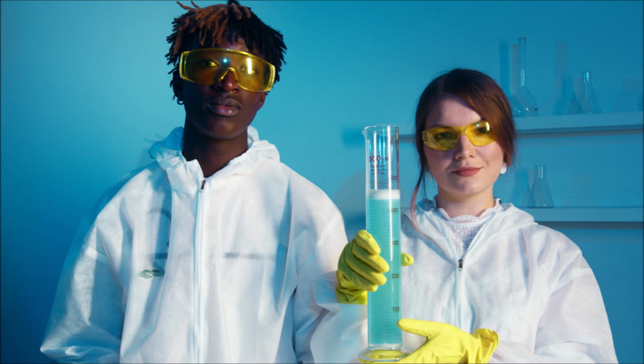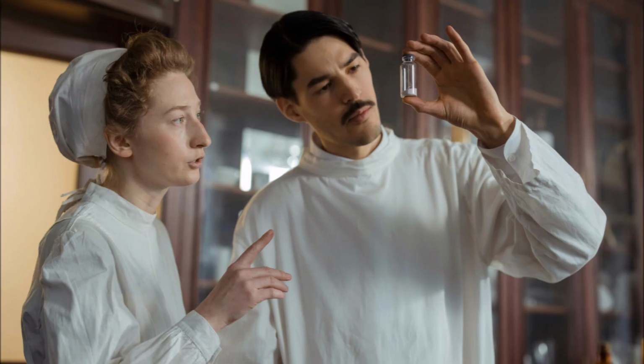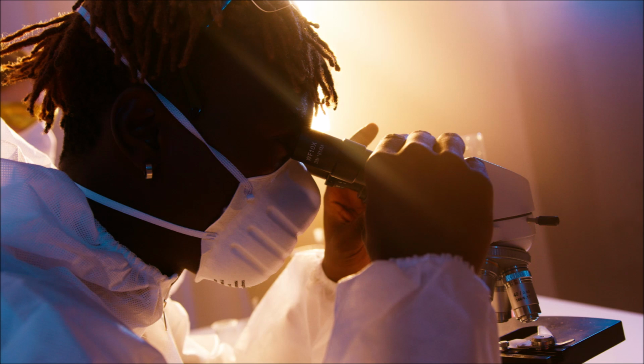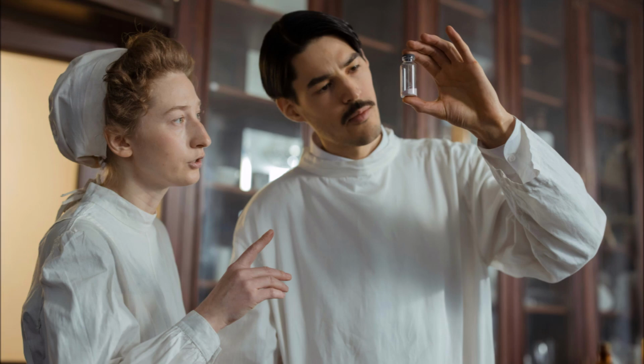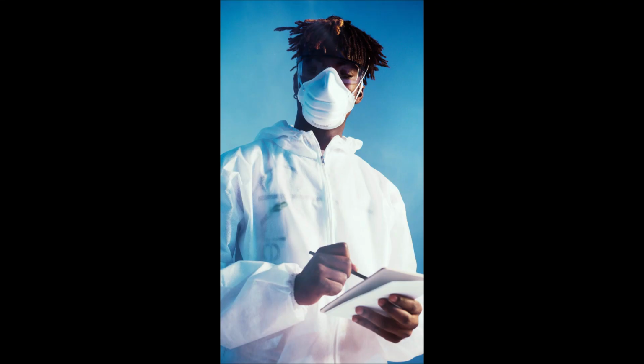sampling tools. The third step, when you are preparing for the collection of the soil sample, is the preparation of the sampling container. You make sure that the container is sterile before you collect the sample by using different sterilization methods. Also wearing protection equipment, like a mask, to prevent exposure to potential pathogens.